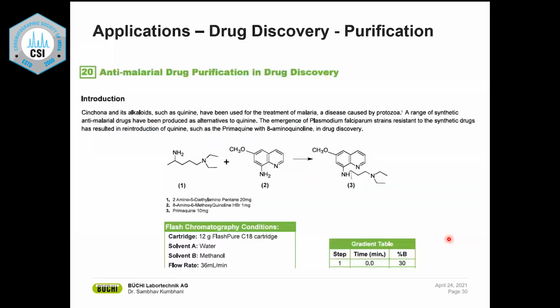Okay, we talked about its application. Let's see where all today flash instruments are used. I would say, if you have taken a medicine in your life, that medicine has gone through a flash instrument once for sure, 100%. So this is a typical example where an anti-malarial drug was purified using a flash instrument.